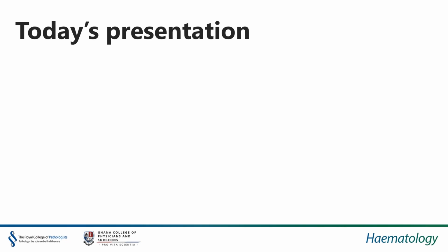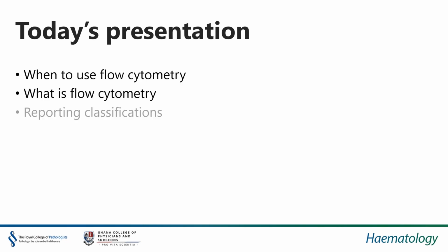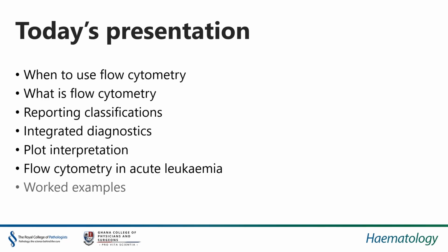So what I'm going to cover in today's presentation is when to use flow cytometry, what is flow cytometry, the reporting classifications that are out there, and also some of the more recent changes to some of the classifications. I'll talk about integrated diagnostics, some plot interpretation, flow cytometry in acute leukemia, and we'll also go through some worked examples.